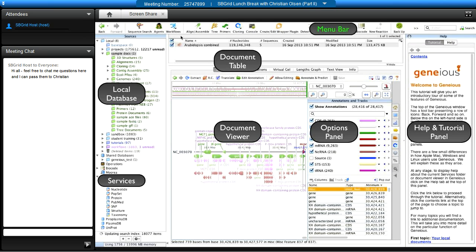Two menu bar buttons I always highlight: first, the green backup button — please get into the habit of using it because you don't appreciate your data until it's gone, so maintain a regular backup schedule. Second, there's a support button where you can submit a question or make a feature recommendation. Our support team is in New Zealand. Use that support button — it's something many users really benefit from.